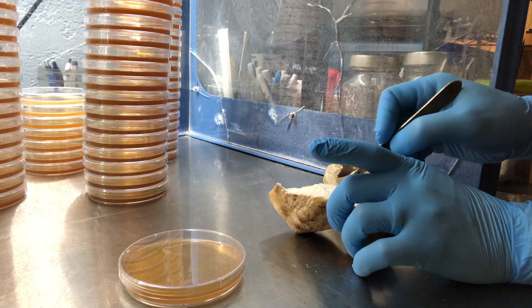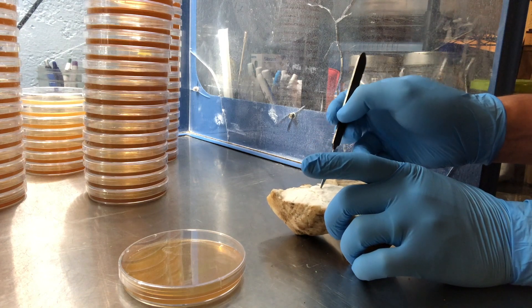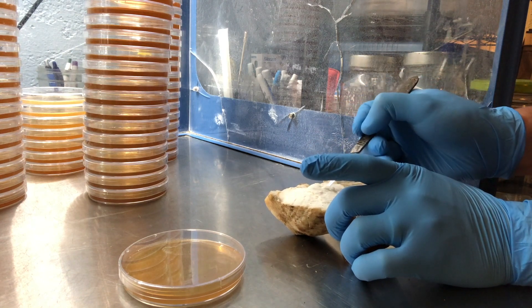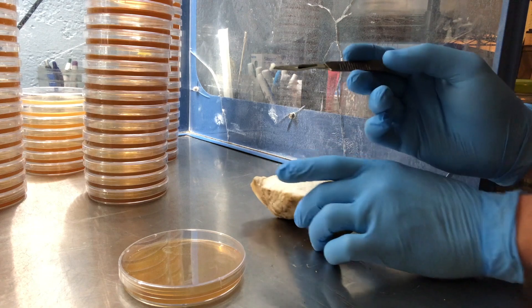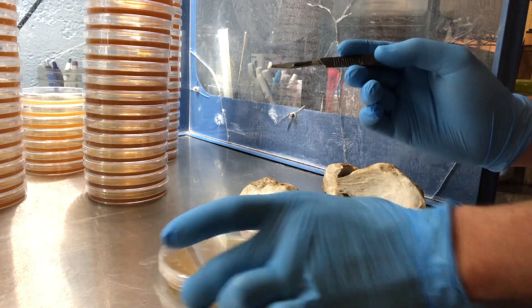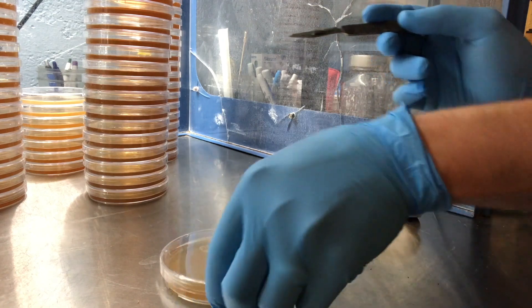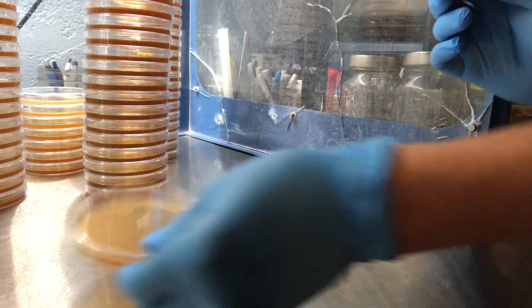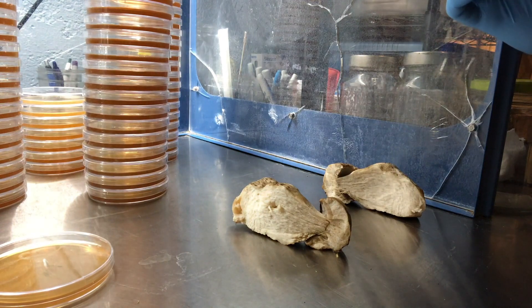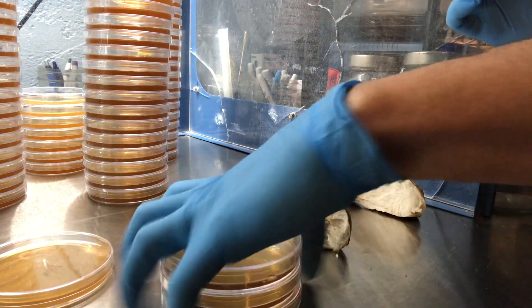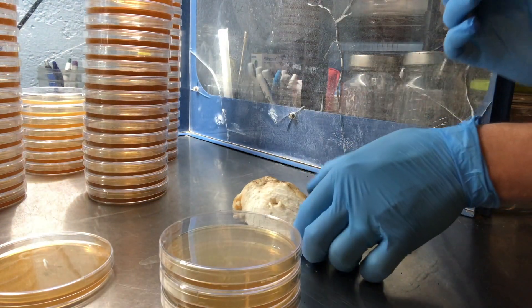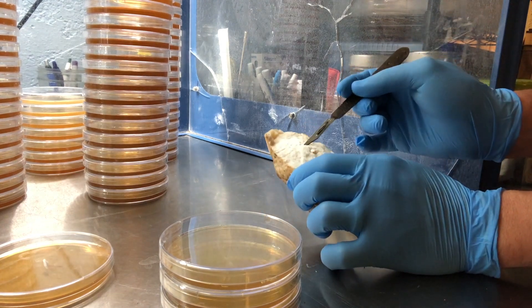Basically you just want to take a piece of this mycelium and then transfer it onto this petri dish. And there we go, we've got a cloned porcini mushroom. I'm gonna use a few more plates just to give it a better chance of good growth.